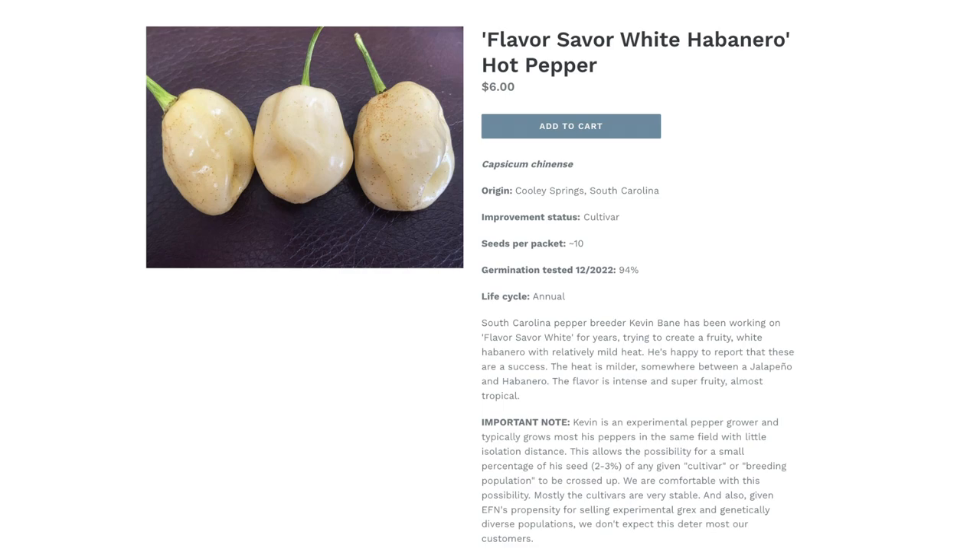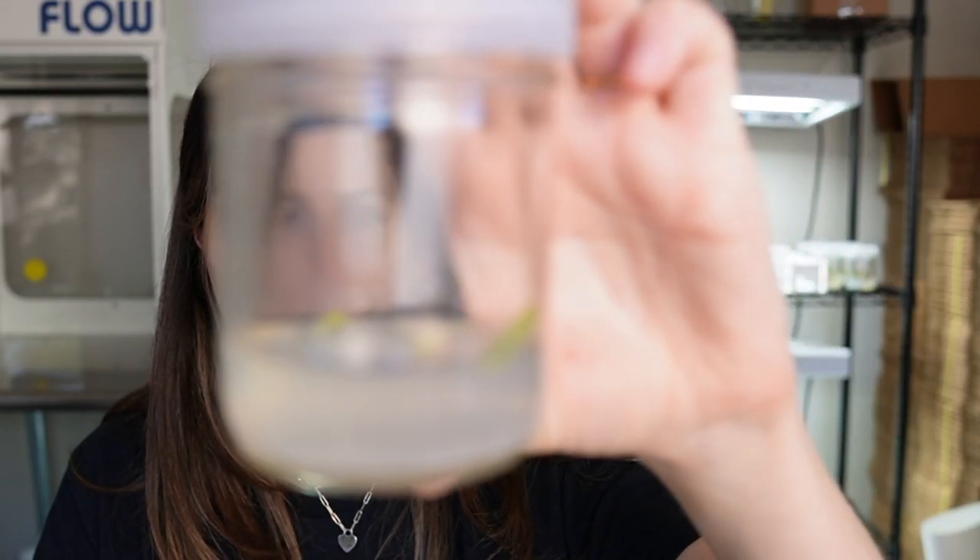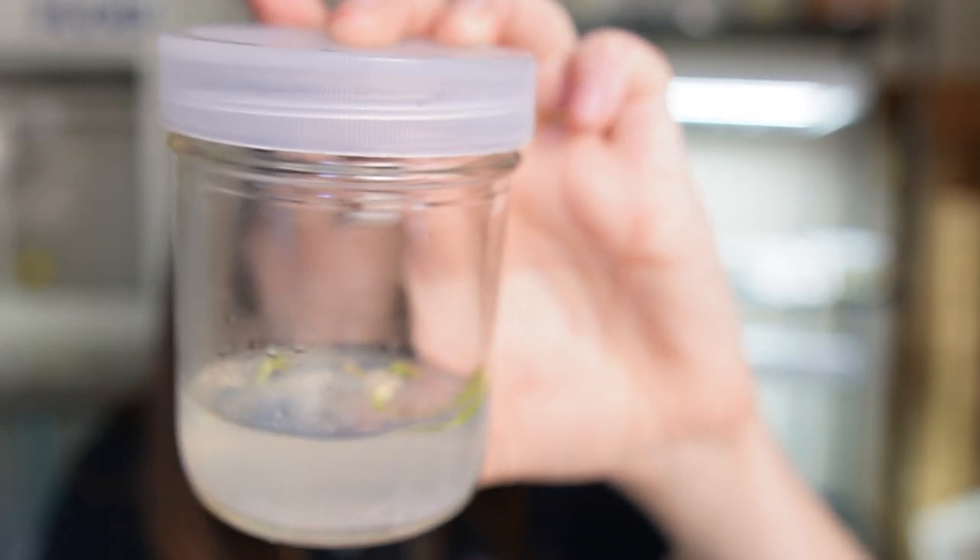I chaotically also started some seeds in tissue culture one day. These are from Experimental Farm Network, which is a cool website, and I think they're some type of white jalapeno or white hot pepper. You can see they're not doing very well — three of the four germinated but they're stuck in the media, like the La Brea tar pit of tissue culture.